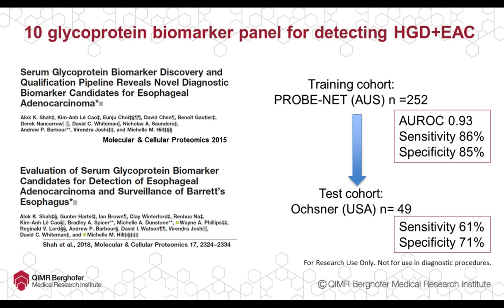Then we used that biomarker panel to test the USA cohort. And the sensitivity and specificity, as expected in this scenario, was lower than the training cohort, but it's still fairly reasonable. And this is quite a promising result from these different cohorts.